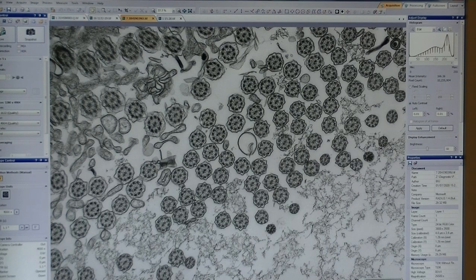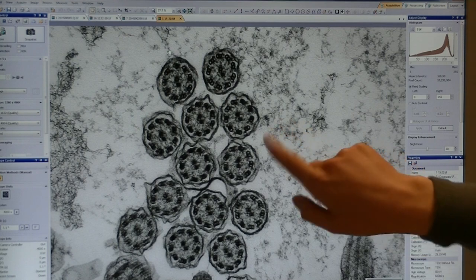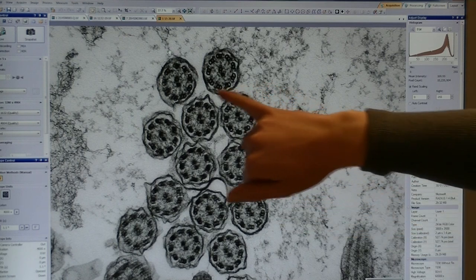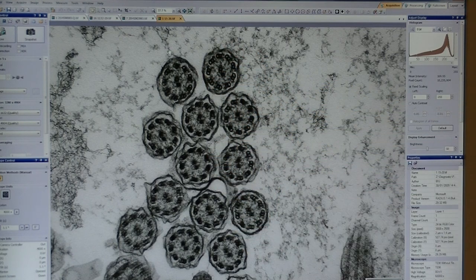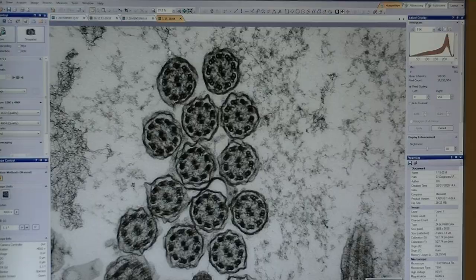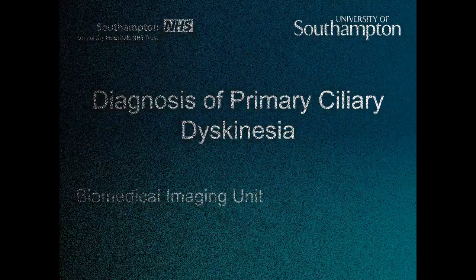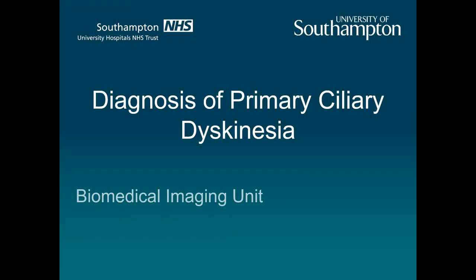We have lots of them here, and if we go in a little bit closer, you can see that they have a nice, normal arrangement and we can see the microtubules really clearly. If you would like to know more about PCD, if you carry on watching I can explain some more about it. I'm now going to give some more information on primary ciliary dyskinesia, or PCD, and the diagnosis.